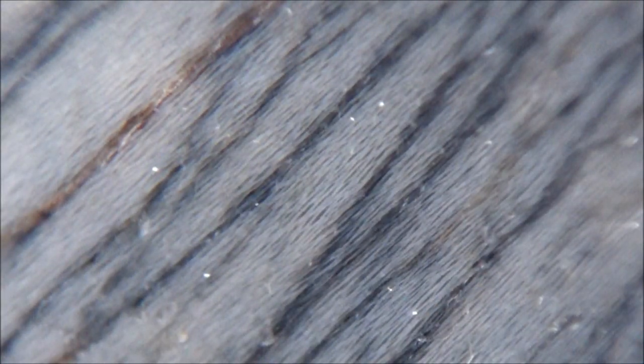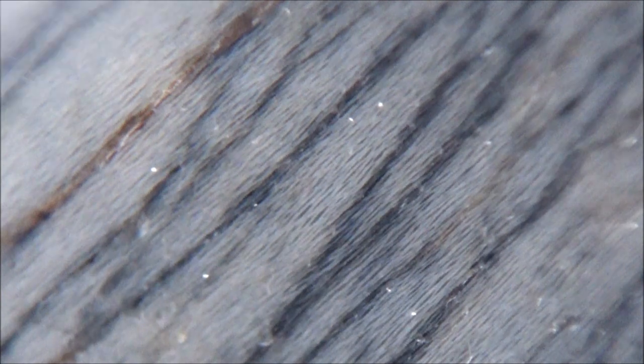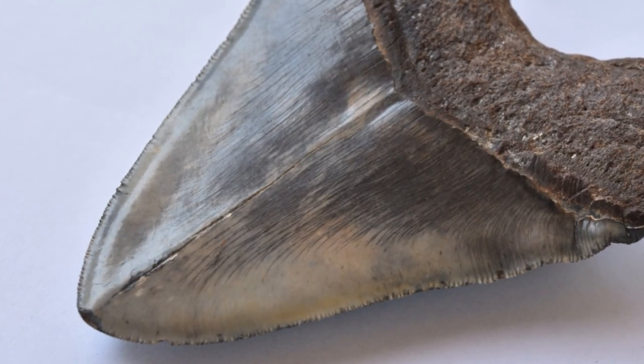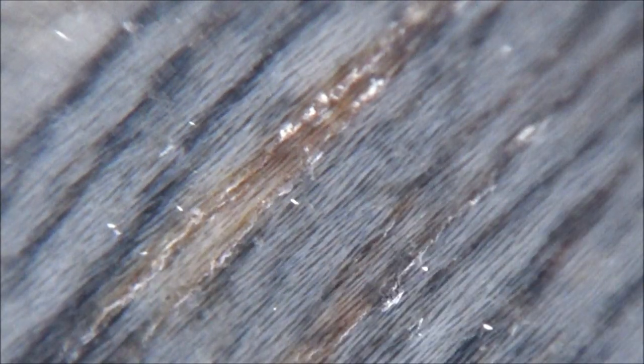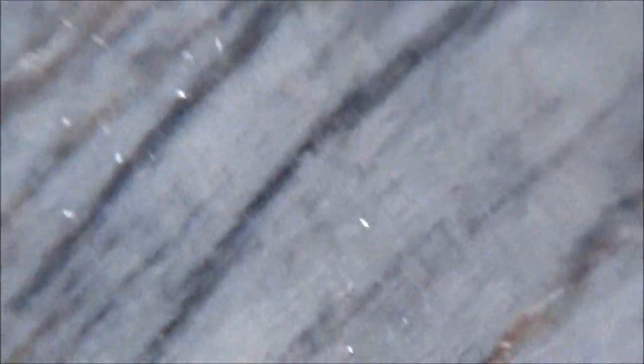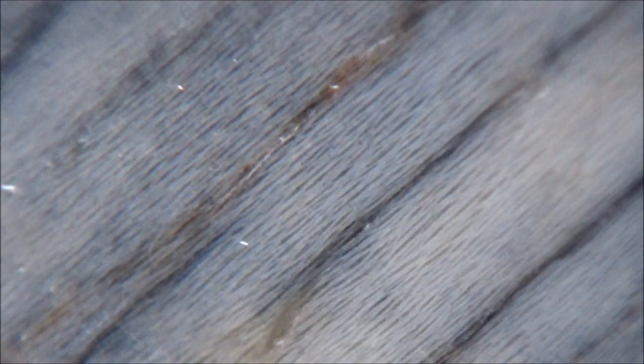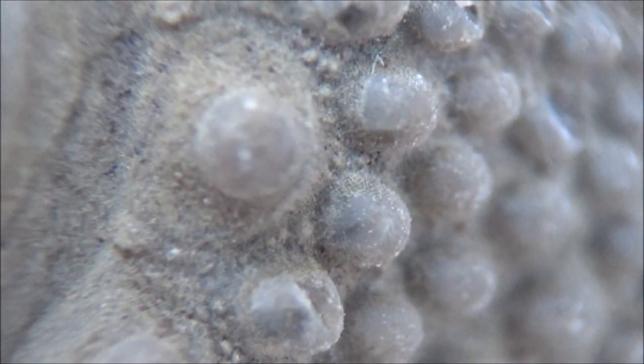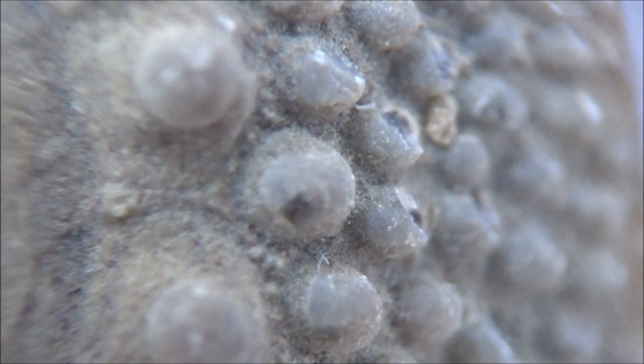Can you guess what it is? It's enamel of a megalodon tooth. And this is a fossilized plate of a sea urchin.